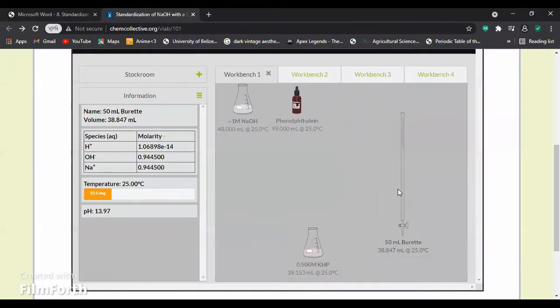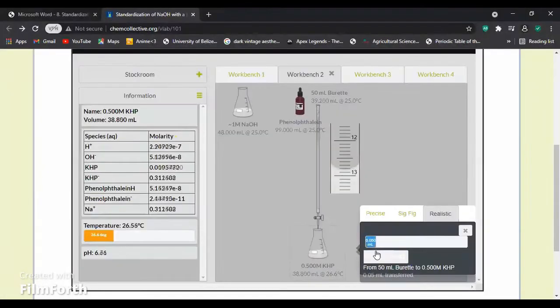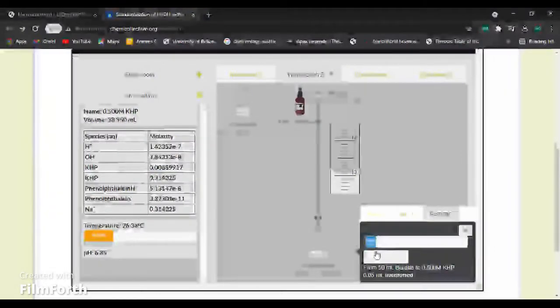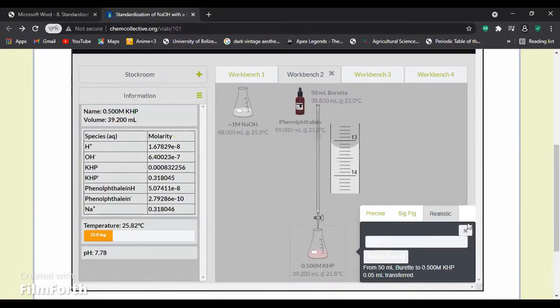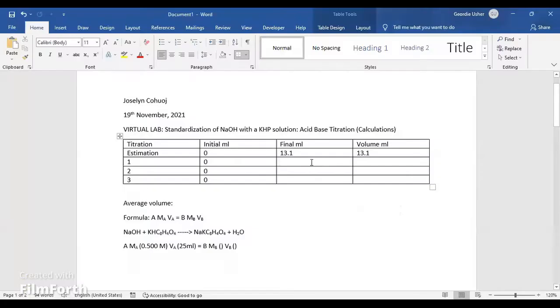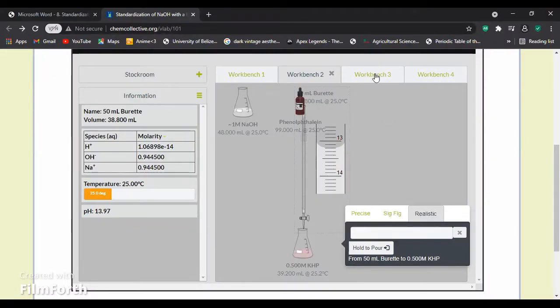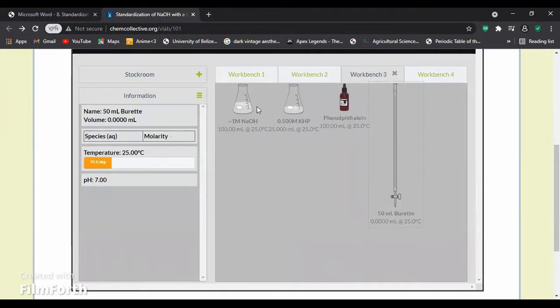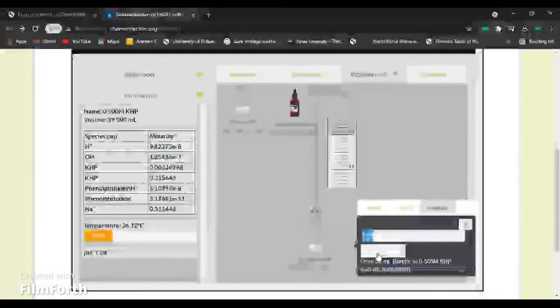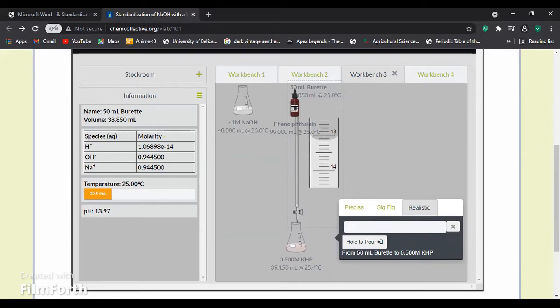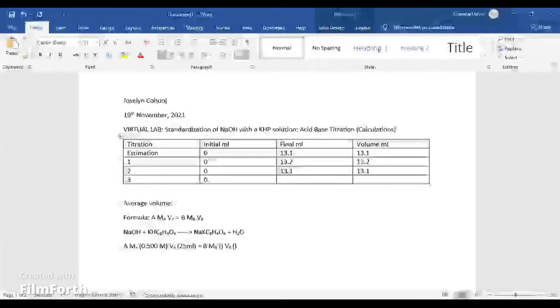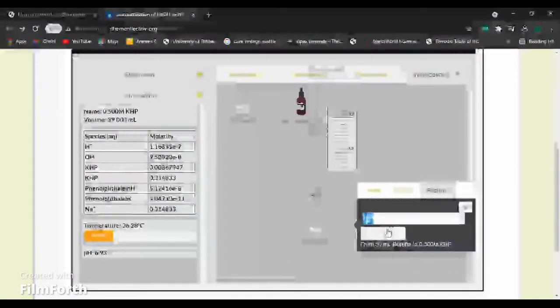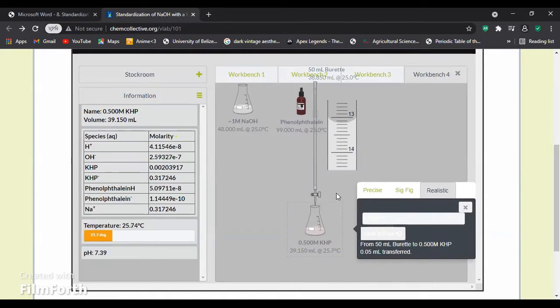I will now proceed to perform the same experiment three times. A slight decoloration has now occurred, so now we will record. So now we will proceed to do the other two. A slight decoloration has occurred again, so we can record this at 13.1. So now another slight decoloration has occurred.